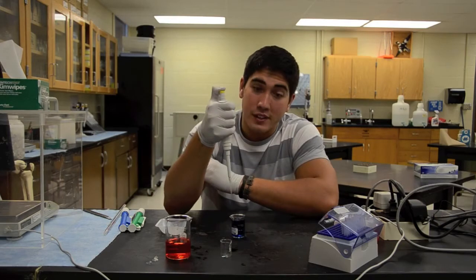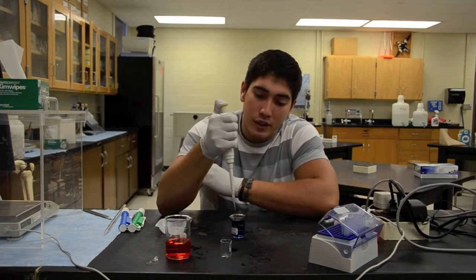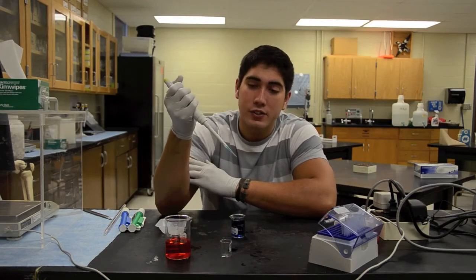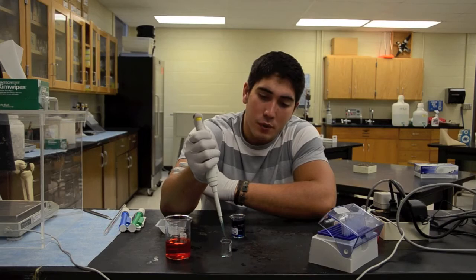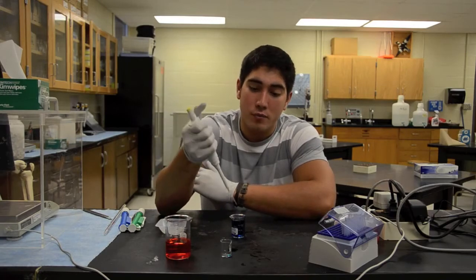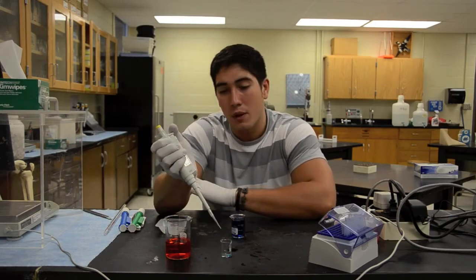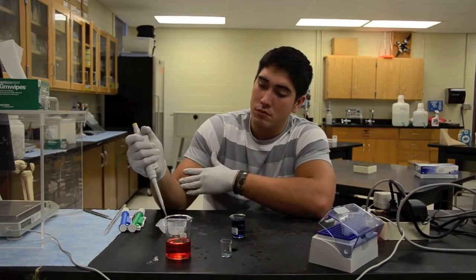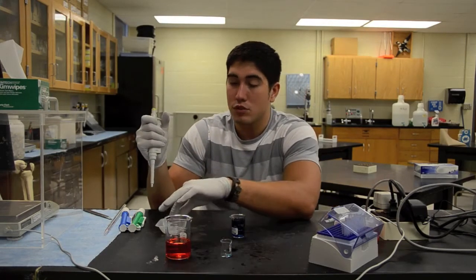So go down to the first stop before we enter the liquid. Slowly pull up. Right there, that's 200 microliters. And we're going to go down to the second stop to eject our liquid into the beaker. And after we go from this solution to our final solution, you're going to want to eject the pipette tip. Smoothly, of course.